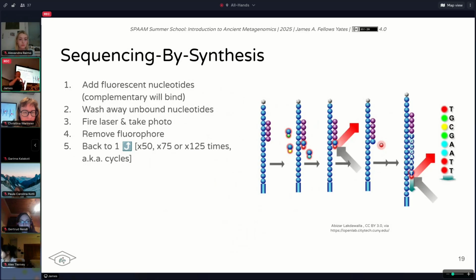when you have done this clustering process, you're then ready to do the actual imaging of the sequence. And as we said a bit before with the Sanger sequencing and things like this, the way this works is, firstly, on the single-stranded molecule, which is floating in on this lawn, a modified nucleotide will float in and be bound onto the next position.